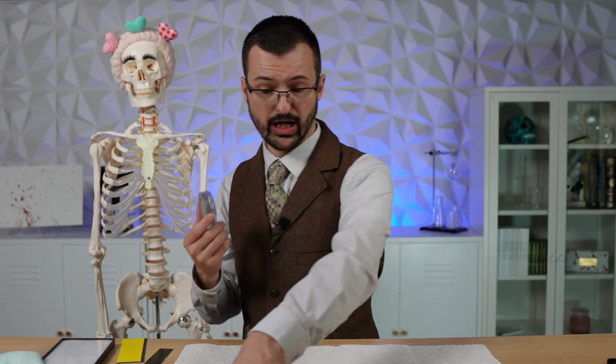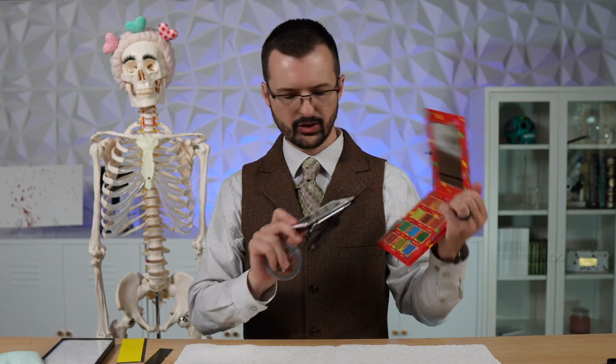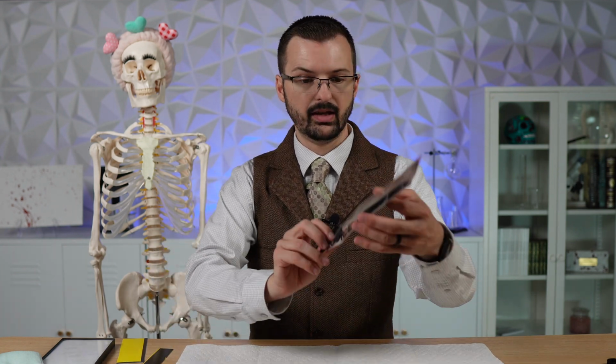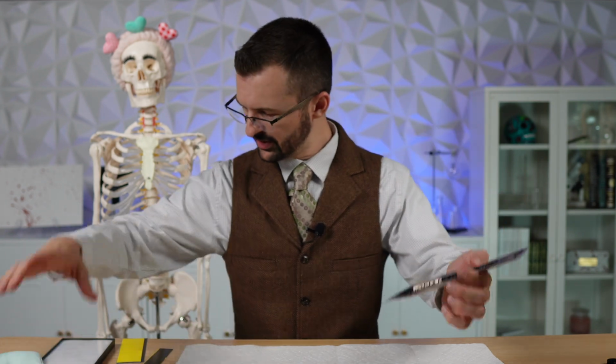First, we need to choose the right items. We have eyeshadows, some fun colors, some darker colors, and then we have foundation, and we have a variety of cool brushes, like this one, and this one goes along with the fun colors. And then we have a few different items to process for fingerprints. With all these different brushes and powders, the fine particles in these products might just help us dust for fingerprints like regular fingerprint powder does, because what we're looking for is a fine powder that can adhere to the sebaceous oils of fingerprints.